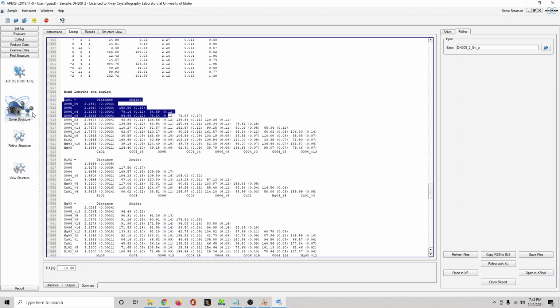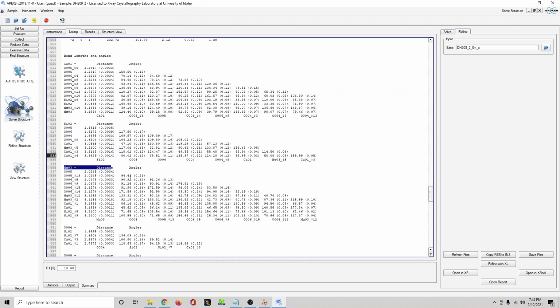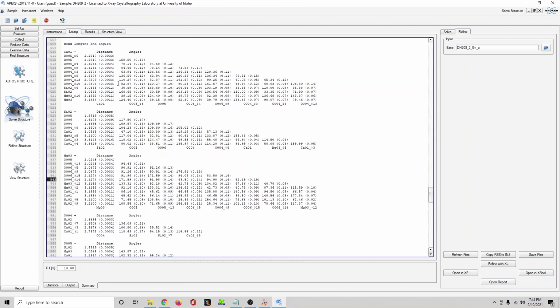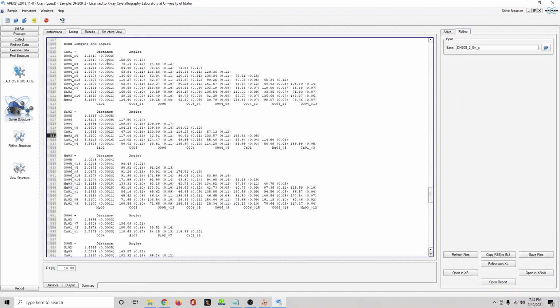So if calcium has a bond length of 2.3 angstroms in a pyroxene or any mineral, pretty much, I would definitely believe it, because that is a very typical bond length. And same with silicon being 1.6 angstroms. That is very believable. Magnesium and iron typically do have bond lengths of around 2 to 2.2 angstroms. So those assignments seem to be correct. And in fact, that is how they are assigned in SHELX, in part, I think. Well, it might be just scattering factor. I should correct myself on that. So if it doesn't assign them correctly, it's because it's assigning based on scattering factor.